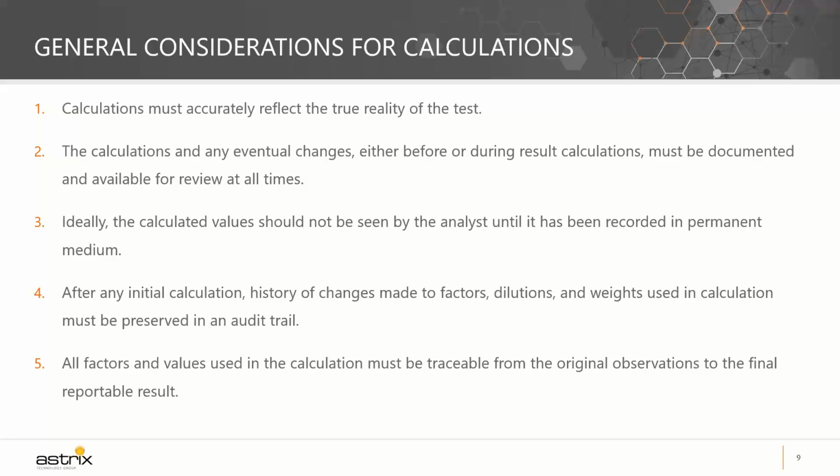2, the calculations and any eventual changes, either before or during the result calculations, must be documented and available for review at all times. 3, ideally, the calculated values should not be seen by the analyst until they have been recorded in a permanent medium. The principle here is to prevent users from picking and choosing what inputs will generate the result that fits their needs.